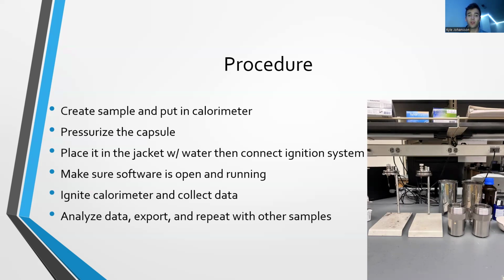The next part is getting a correctly sized piece of ignition wire, which should be around 10 centimeters, and it is very important that the exact length is noted due to it having an effect on one of the previous equations when solving for the heat of the system. After cutting and measuring the wire, the calorimeter can be put together. During this step, it is very important that the top part is held upright the entire time so that the sample in the basket does not spill out.